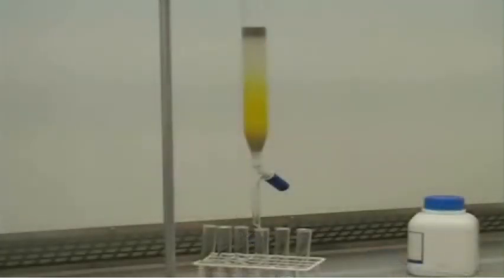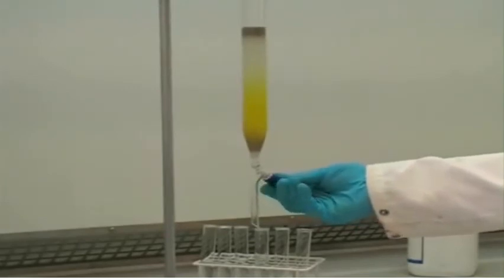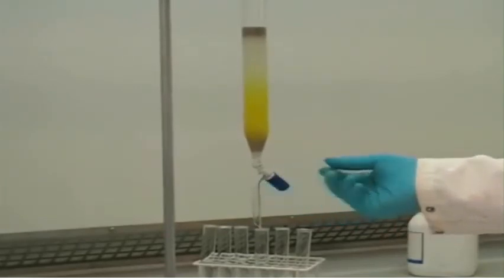We can then continue to collect fractions, and in this case you can see that the yellow band in the silica is approaching the bottom of the column. If we look closely at this particular fraction, we can see that the solvent has a yellow colour, telling us that our compound is eluting. Of course, in other cases, as mentioned previously, you'd have to use TLC to identify the presence of the compound.